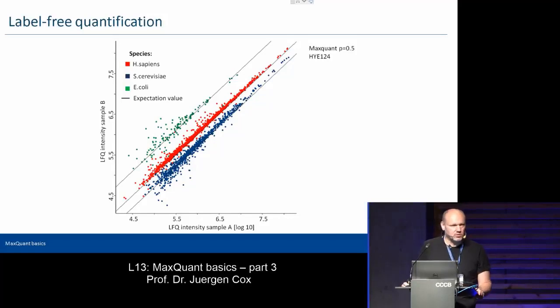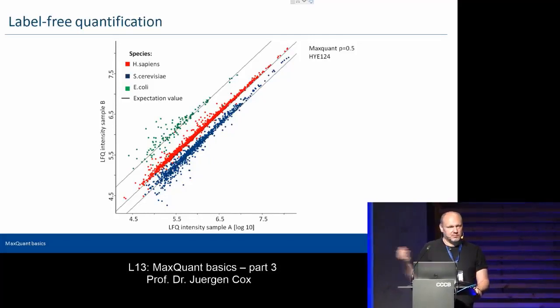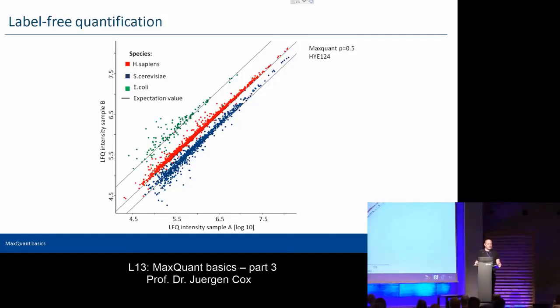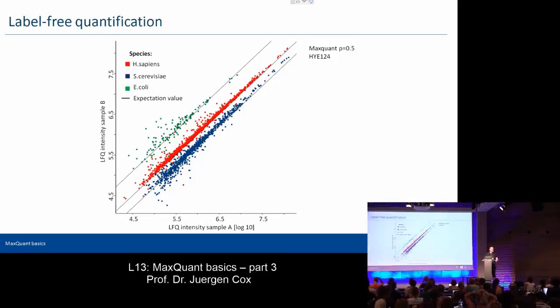Well, reanalyzing old data, it depends what you are doing with this data. It certainly had valid results. Nothing was majorly wrong in, let's say, a version from 8 years ago. But you might have higher identification rates now, and better quantification now. So if it's published and just lying there, there's no major reason to reanalyze it. But if this old data becomes part of a new project in some way, then it would make sense to analyze all of this together with the new version.